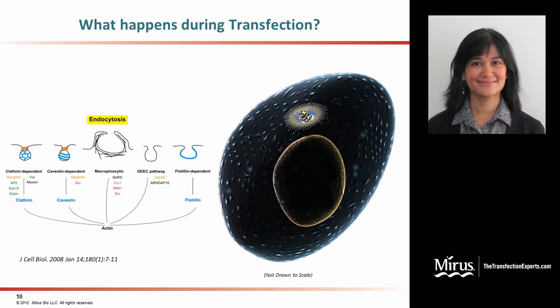These endosomes then go through a variety of endocytic pathways and the transfection complex finally lands up in the really low pH environment of the endolysosomes. For effective functionality, however, the transfection complex and also the nucleic acid needs to escape this low pH environment and get released into the cytoplasm. For nucleic acids such as siRNA and mRNA, the cytoplasmic location is sufficient for functionality. However, in cases of plasmid DNA, there is further shuttling required into the nucleus so that gene expression can ensue.